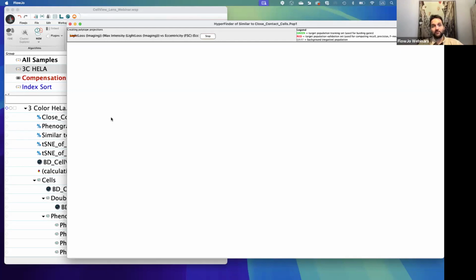That I could gate with, or use the tSNE and start to make different heat maps and see what this specific island expresses in that case. Yeah, so here it can give you insights if you don't want to transfer the whole gating strategy to Chorus, you can still get some insights of which parameters are quite different than the rest of the events within that sample.